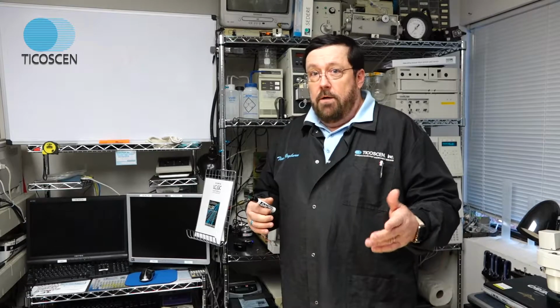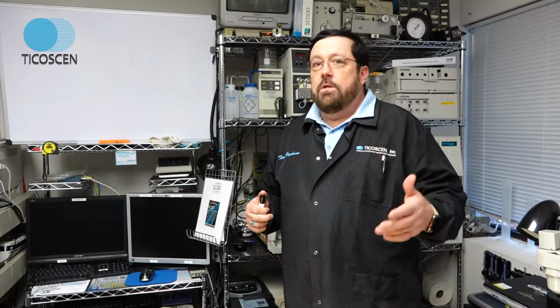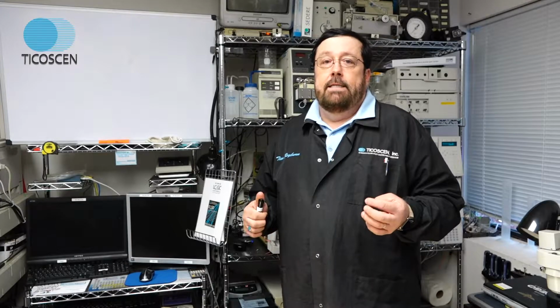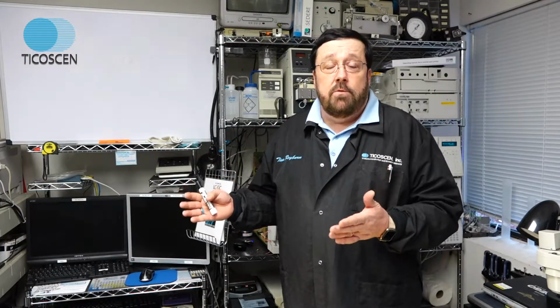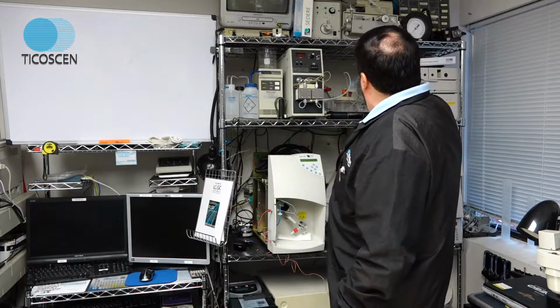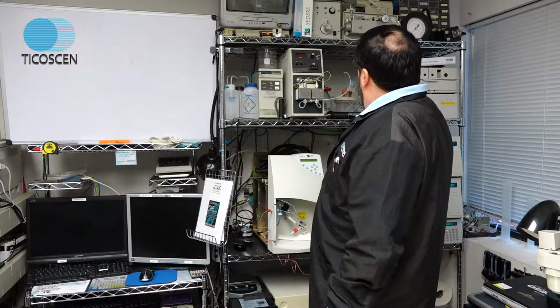You have milliQ water, you have HPLC grade water, you have distilled water. There's different water sources you can get, but even distilled water can have some turbidity. The ideal water you want to get is milliQ water, 18 megaohm milliQ water. Usually most laboratories have that. You want to freshly decant it into your solvent bottle. Right here is a 1 liter bottle and 2 liter bottles, whatever.